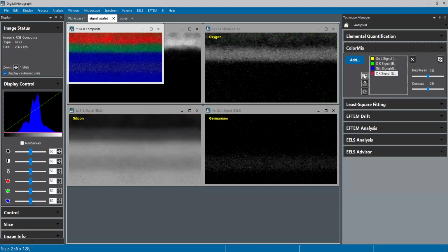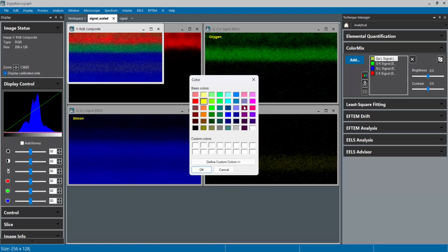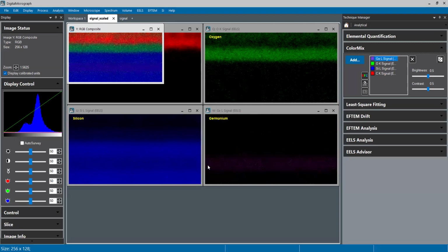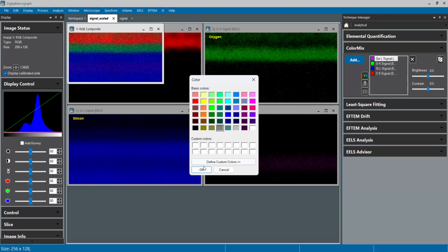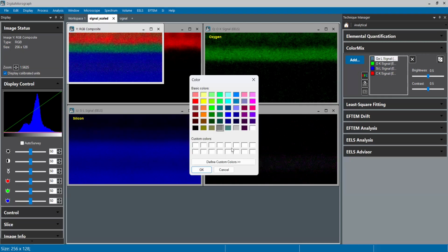Okay, colorize these. Now here's where I found that this was easier to see with the yellow here rather than the magenta. If I put this on the magenta, you can see that doesn't really show up quite as well. You could try some other things like this gray. And not really. Again, it's very weak there.